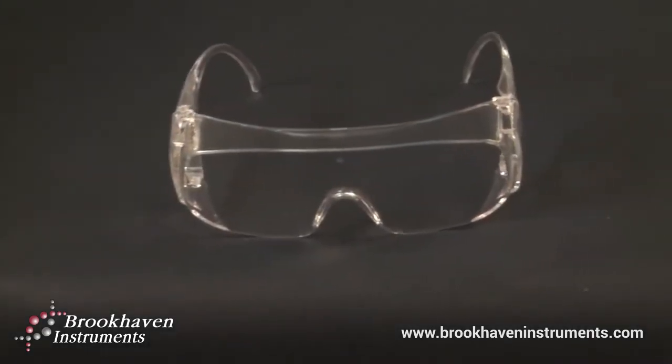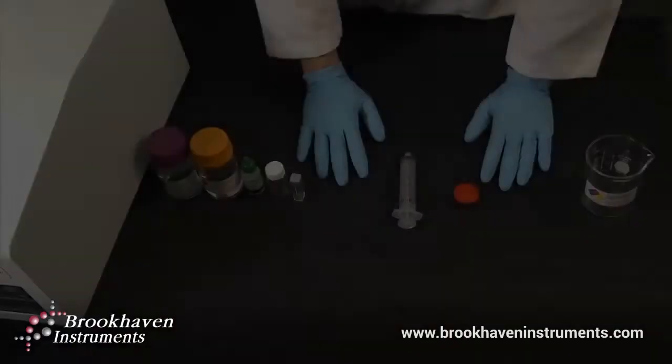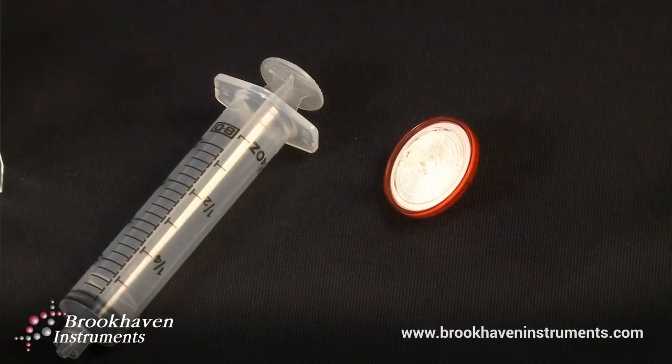Please remember safety first and always wear protective eyewear and gloves during the duration of your sample preparation. The first step toward proper sample preparation is in the use of your glassware, syringe, and syringe filter.